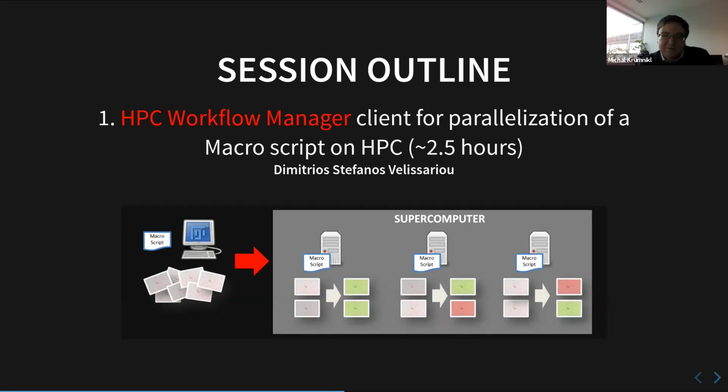And when this calculation, that image processing will be done, then you will see how to download them back to your computer and basically use the results that you have obtained this way. So this will be the first part. It's mainly the introductory. It's for beginners, and Vlado's intros will be for a little bit experienced user. We will try to teach you how to parallelize your code.